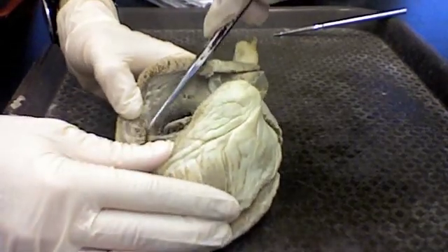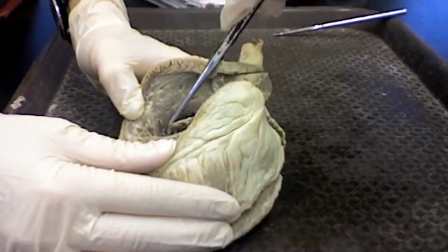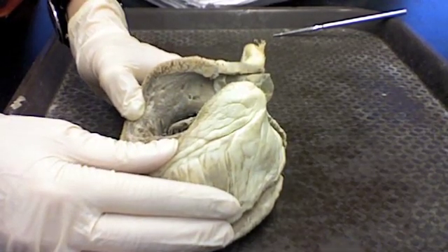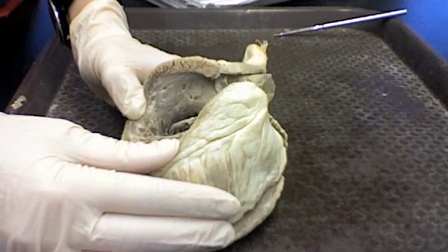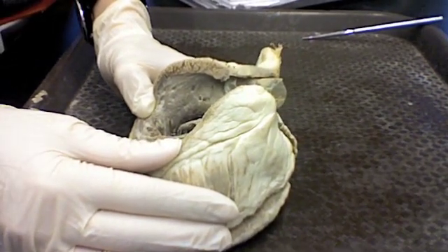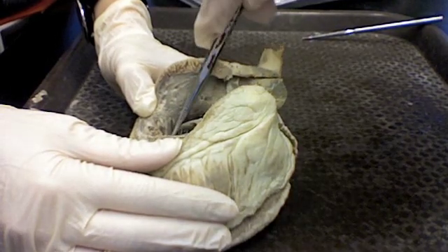Now the sheep has this bar that goes across — we don't have that. This is a bar that's there to regulate the ventricle so it doesn't overfill. It's kind of like a bungee cord so it doesn't expand too much. That's what that is. We don't have that though.